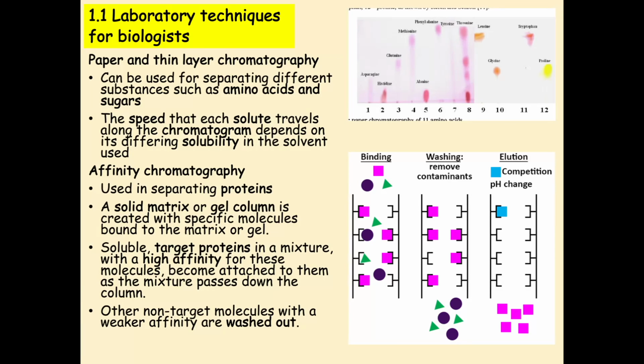And again, it works in the same means that they move towards the solvent front at the top, away from the solution at the bottom, and the solute will travel depending on its solubility within that. Affinity chromatography is slightly different. We use that to separate proteins, okay, so much larger molecules.